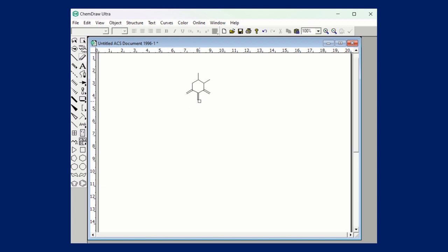And if you want to add text, suppose you have drawn a double bond over here and you want to add some atom over here, then click on this text box and click, and then again click here. Where the blue one is appearing, if you click there, then you can add your text. You can add oxygen, nitrogen, or whichever element you want to place, you can just type that. By default it will type small letters. You have to type in capital letters.